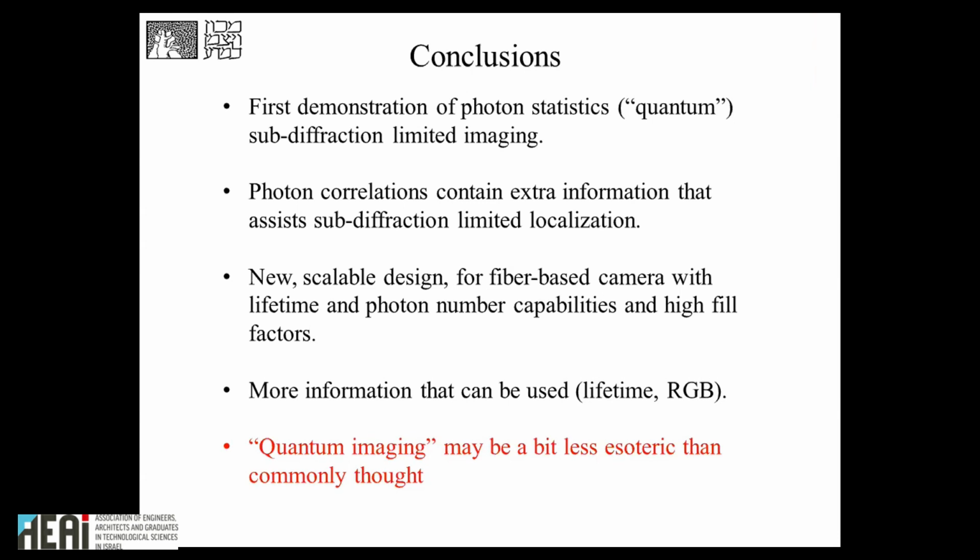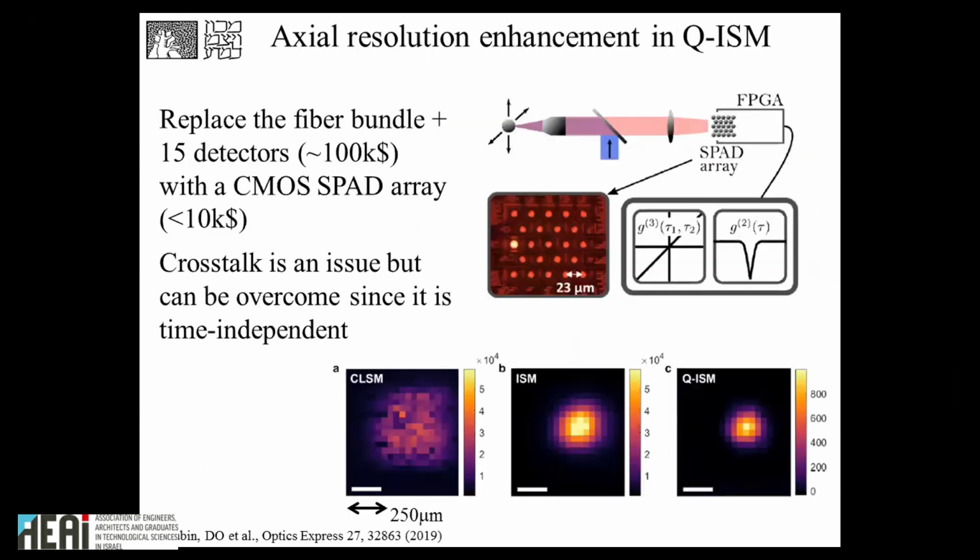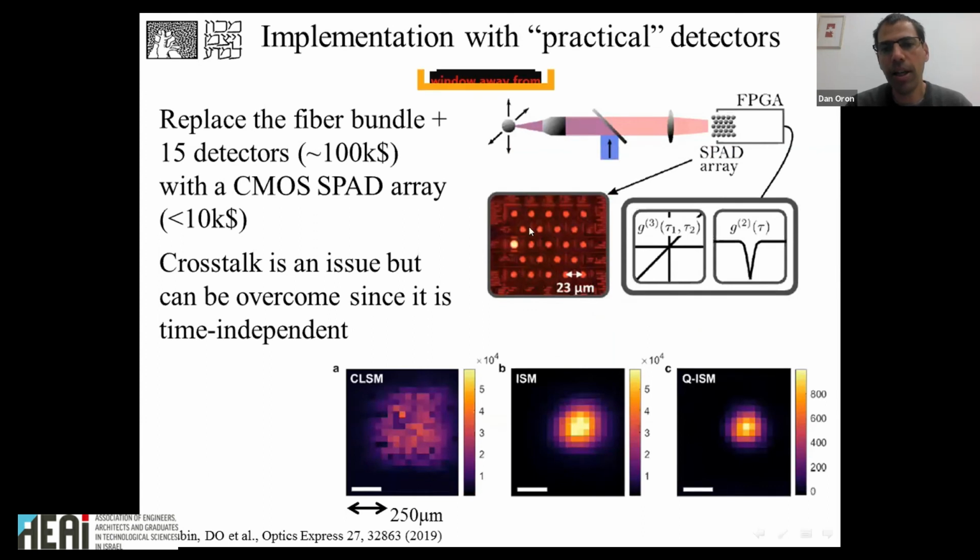And regarding the pixels, you show in one of your slides many pixels that you use at the same time, but they have some difference in their characteristics, in the performances. You mean here? Yes, this is a plague of avalanche photodiode arrays. Not all avalanche photodiodes in an array are made equal. Some of them, like this one, have higher noise characteristics. That's what you see here.